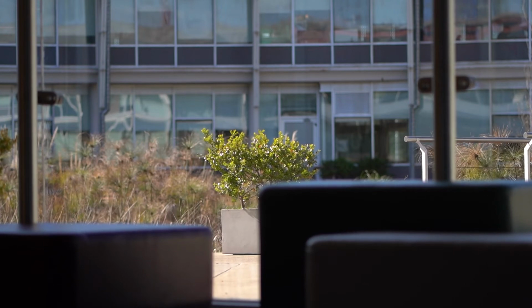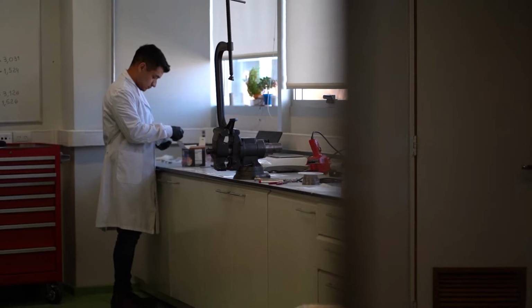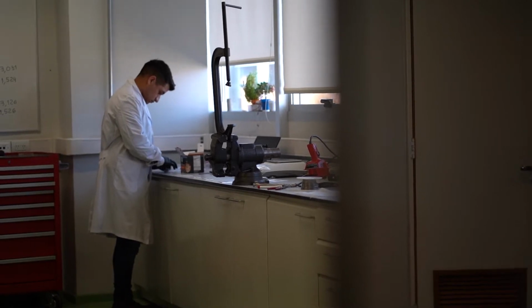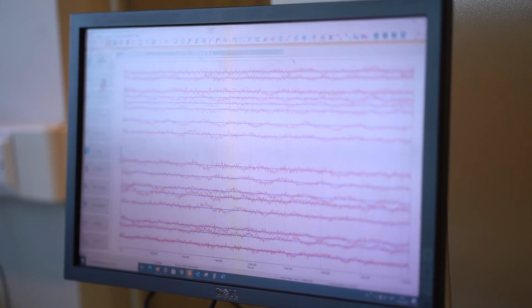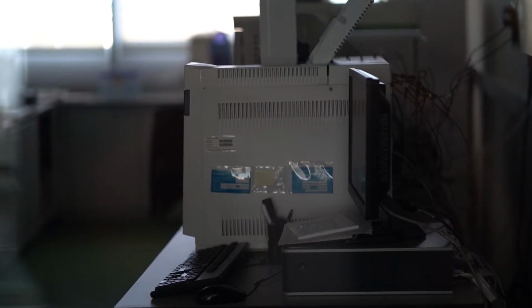When the rock samples arrive to the lab, what we do is we cut parts of it to be able to study it in different apparatus. The geologist or the engineer or the geophysicist or the geochemist may select different parts of the rock of different sizes, and then we cut them and we make, for example, plugs like this one. It depends on what you want to study. You may have thin sections, you may have 1-inch plugs, you may have bigger samples.